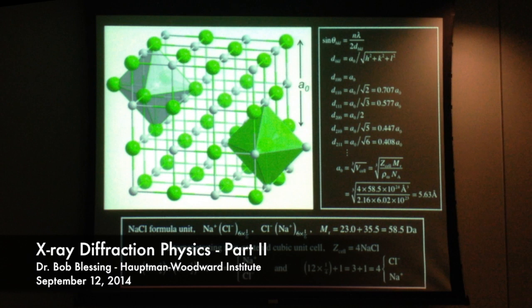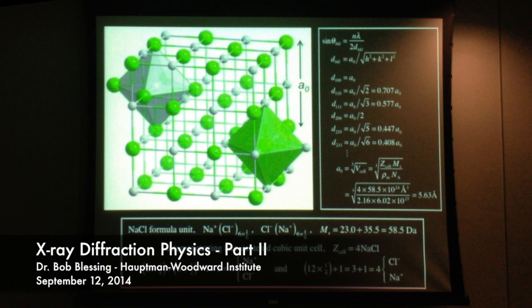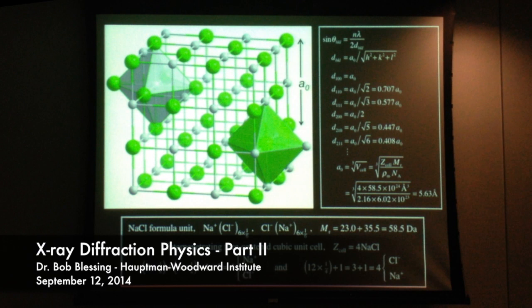the scattering in a direction that's between the integer index points in the reciprocal lattice. There's information there too, and one of the things of the BioXwell project is to digest and interpret that information, from which we can learn a lot about the dynamics, the motions of atoms and molecules in crystals. And we get those force constants that also pertain to functional dynamics of macromolecular crystals, hinge motions and so on.